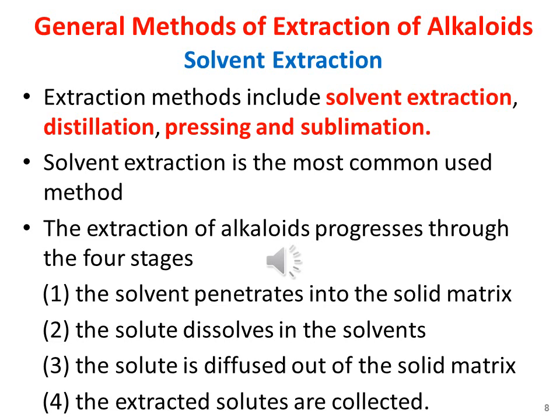Generally, the finer the particle size is, the better results the extraction achieves. The extraction efficiency will be enhanced by a small particle size due to the enhanced penetration of the solvent and the diffusion of the alkaloids. Too fine a particle size, however, will cause excessive absorption of the solute in the solid and difficulty in subsequent filtration.